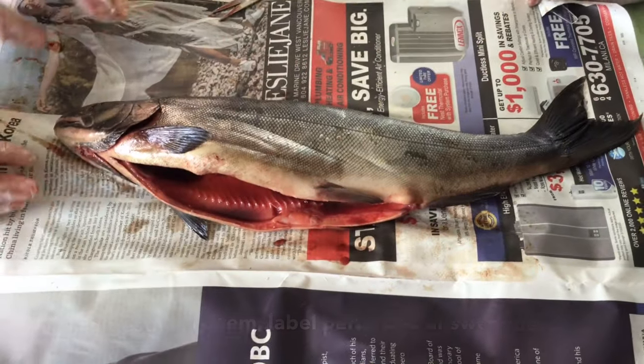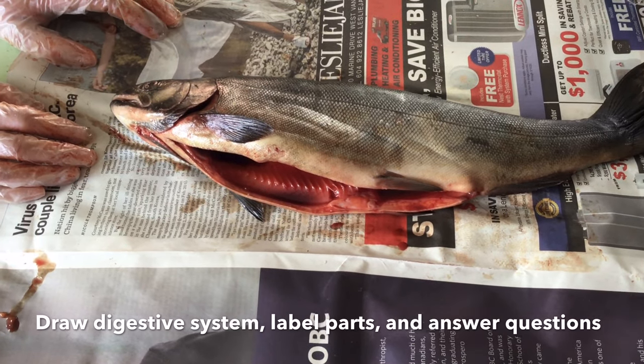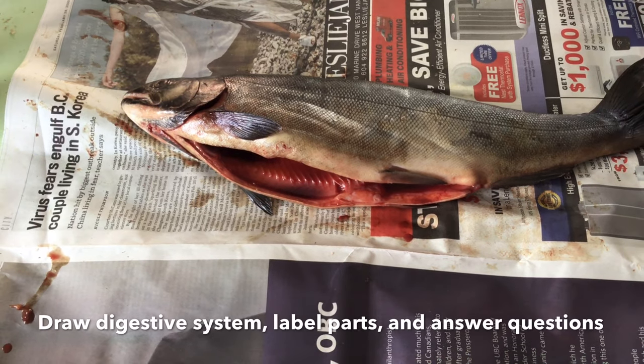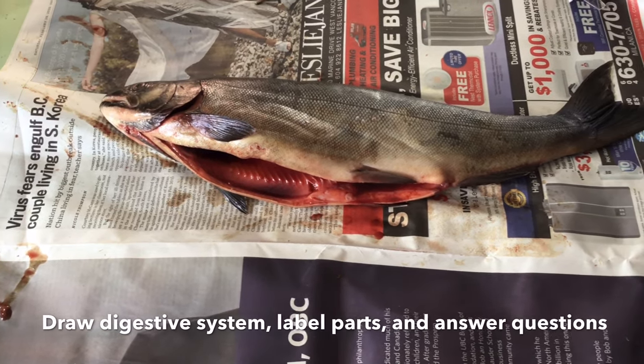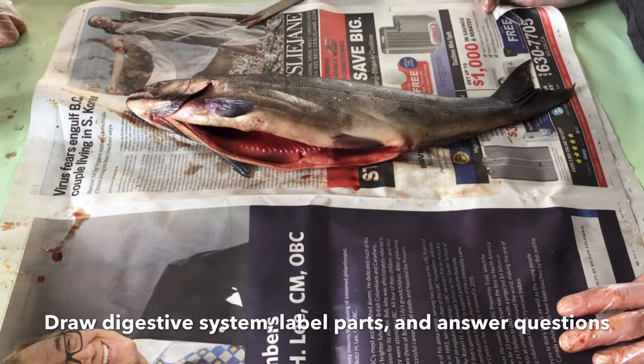That's the digestion. So you're going to draw the digestive system from the plate into the place on your booklet, and label the parts, then answer the question on the following sheet about similarities to our digestive system and the salmon's.